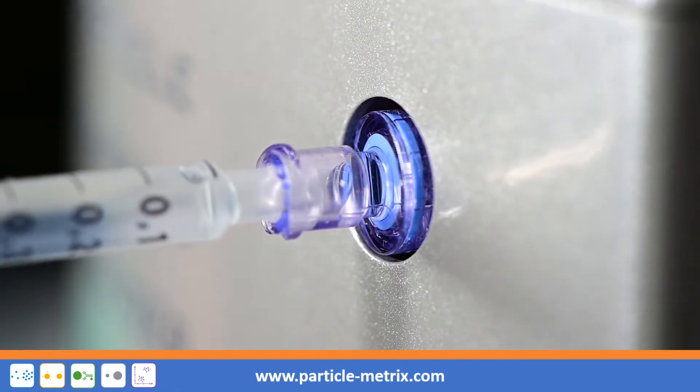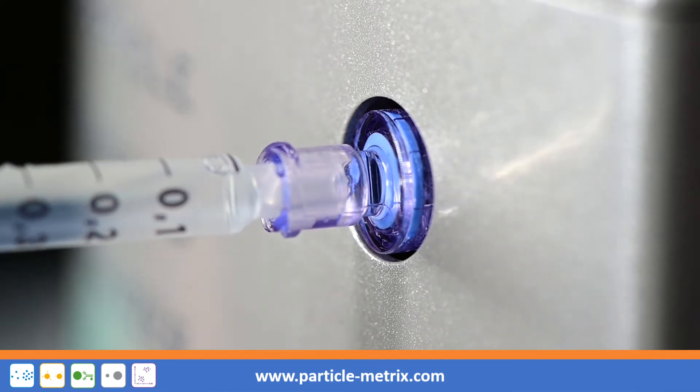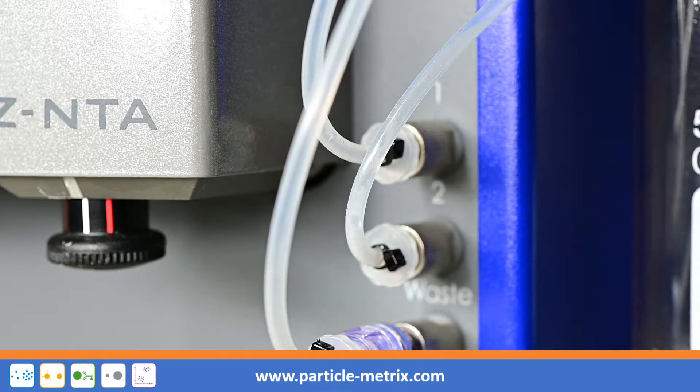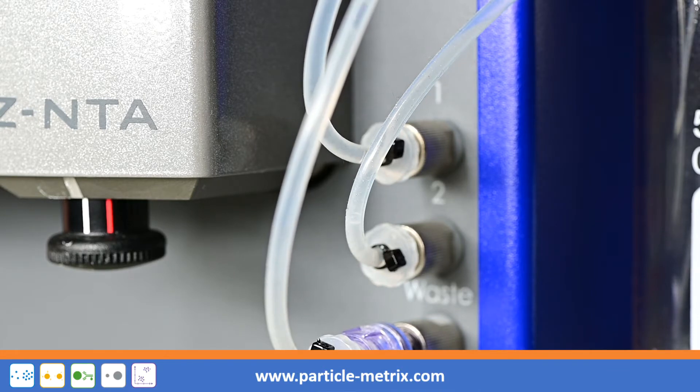Air bubbles can usually arise by introducing them during the injection process or because the instrument and the cell assembly were insufficiently rinsed with water or buffer.